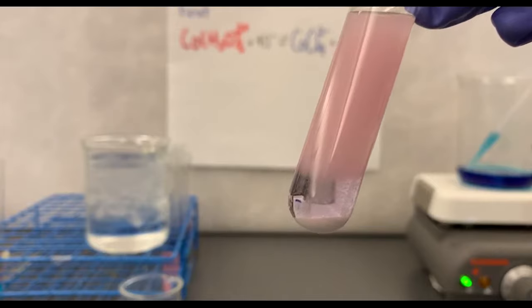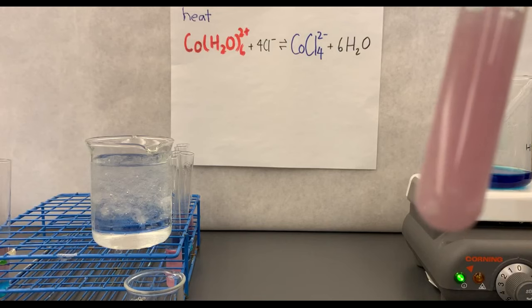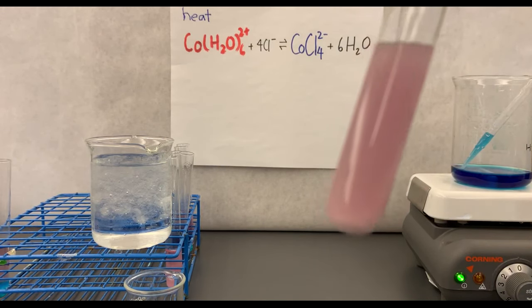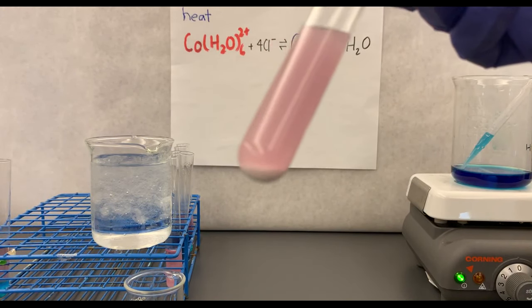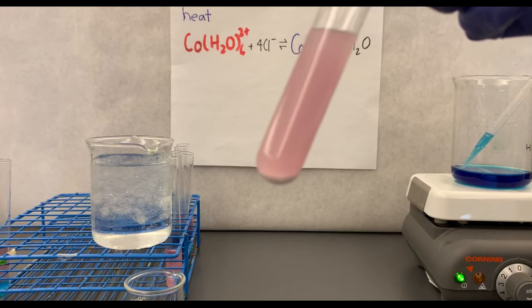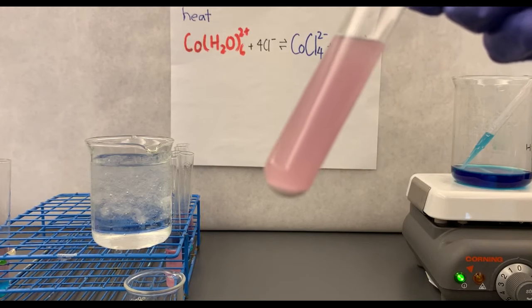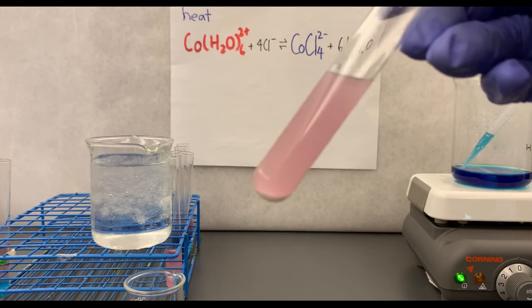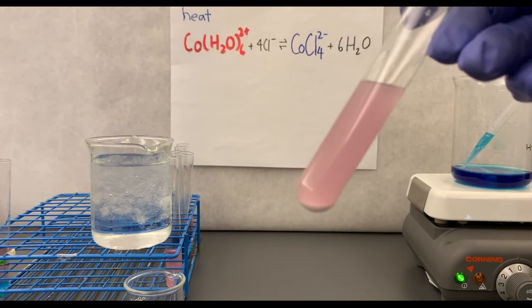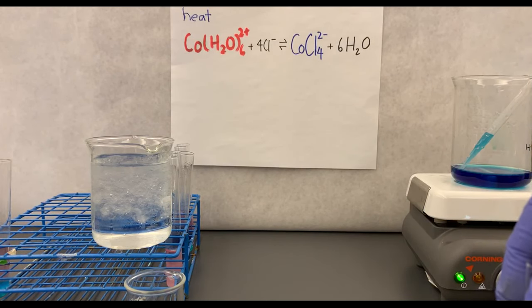It was purple. And now if I give it enough of a flush, you'll see it. Okay. It's almost completely all pink, right? Yeah. Okay. There is a precipitate of the silver chloride at the bottom, but in the solution itself is your cobalt water complex, which is now pink. Okay, so for the second observation for test tube number 4, you should write down that it was purple, but now it is pink. And the reason for that is because you've removed your chloride minus because it forms AgCl and it shifts the reaction to the left. Okay.